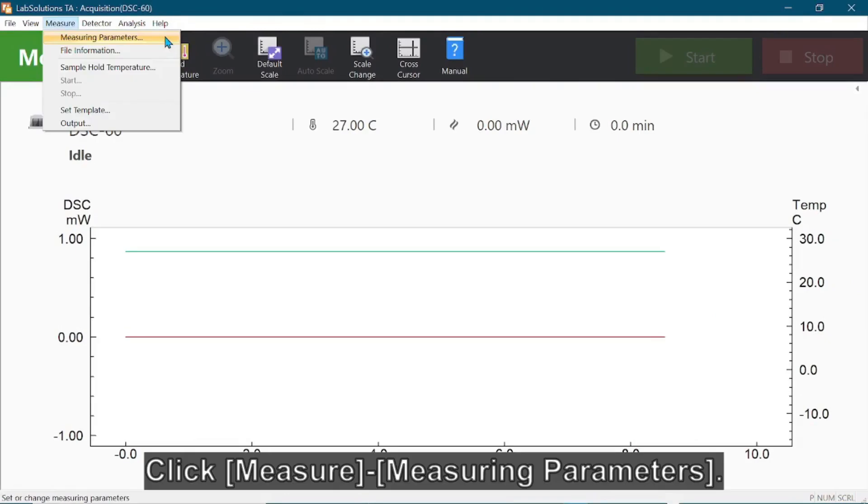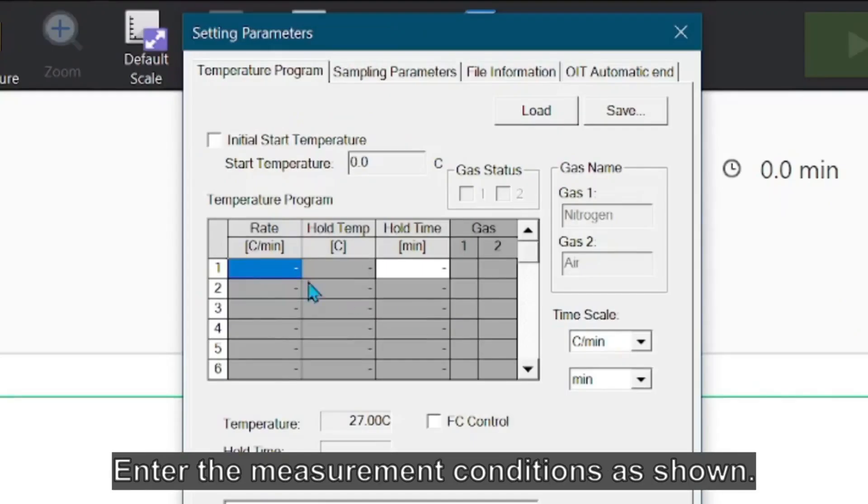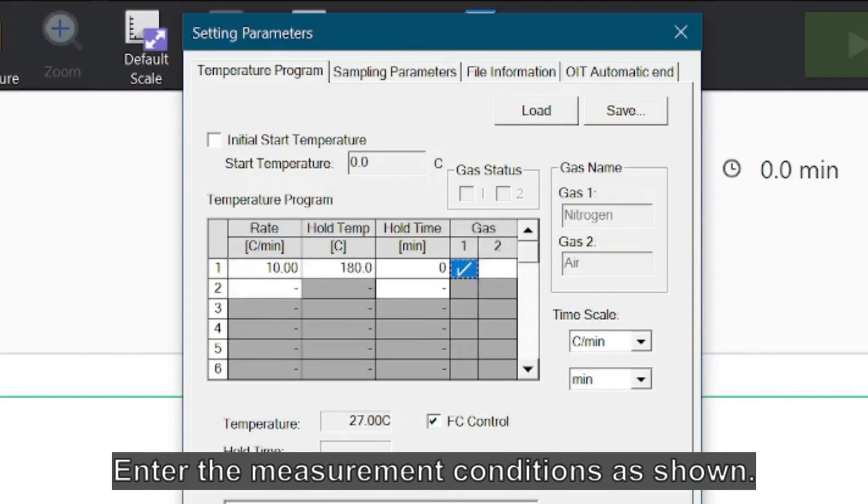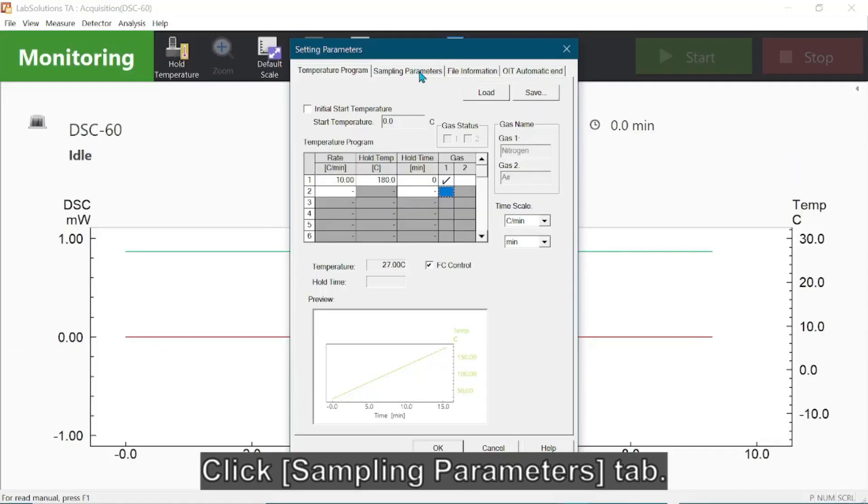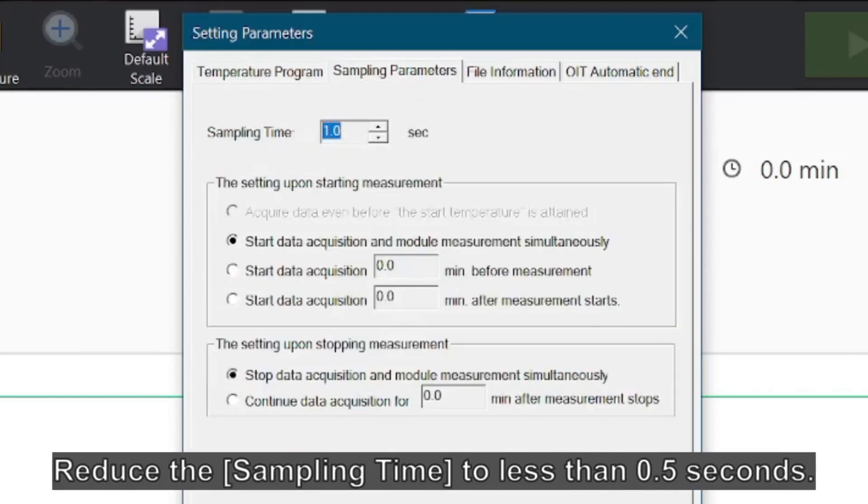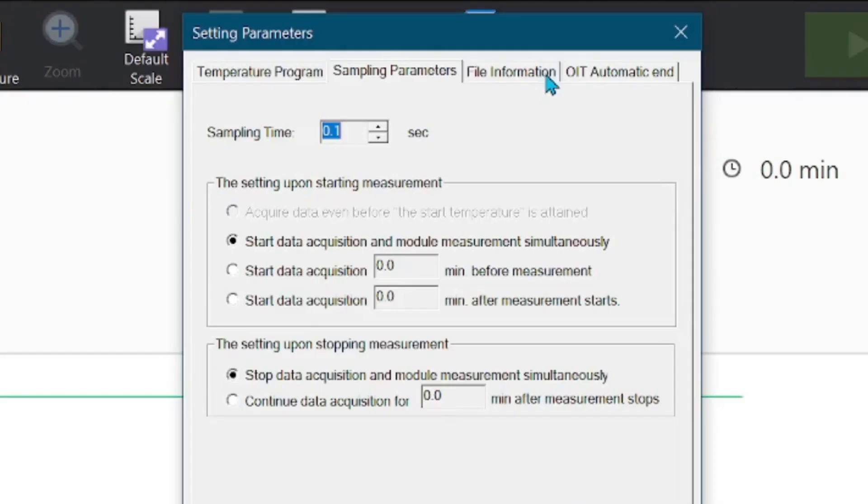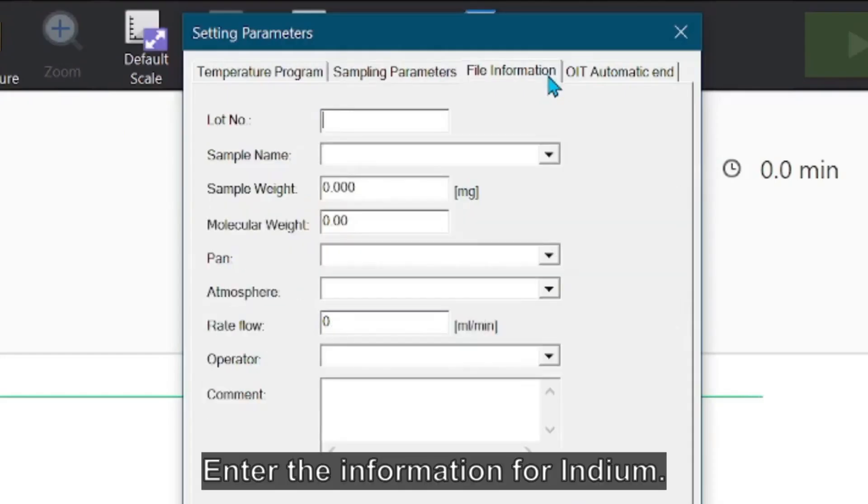Click Measure and select Measuring Parameters. Enter the measurement conditions as shown. Click Sampling Parameters tab. Change the sampling time to less than 0.5 seconds. Click File Information tab and enter the information for indium.